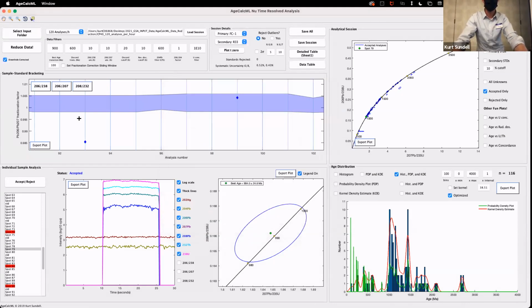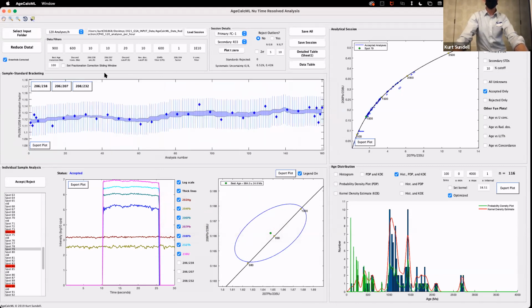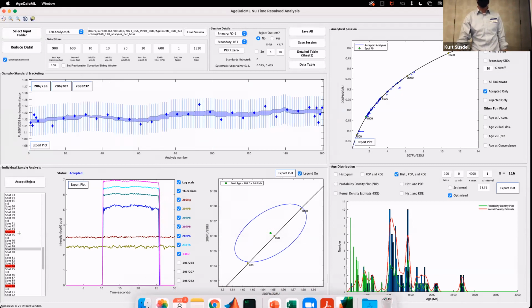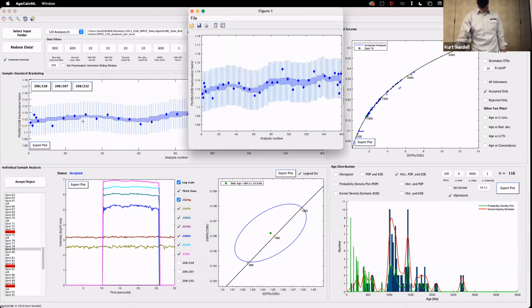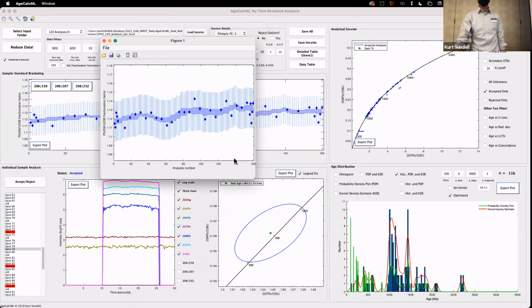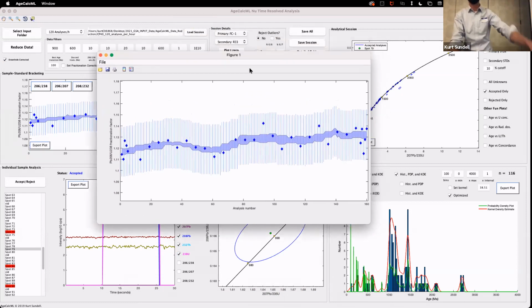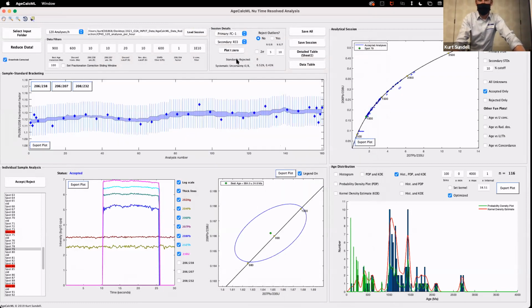So all of these plots, if you submit your data for publication, they say, hey, I want to see that fractionation plot. You get a real stickler, like, oh, I need that fractionation plot. You can go to your sample, reload it, and say, here you go. Looks great. Or, yeah, it looks okay. A little bit of positive drift. It's fine. It's fine. And that's basically the program.